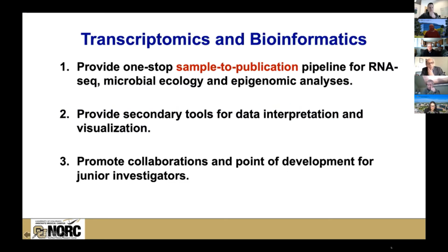So the goals of this core really are to provide a one-stop sample to publication pipeline for primarily bulk RNA sequencing, but we also do microbial ecology analysis and then bioinformatics for epigenomic analysis. And I'll walk you through what this really means and what kind of applications you can look at in the context of your own work.